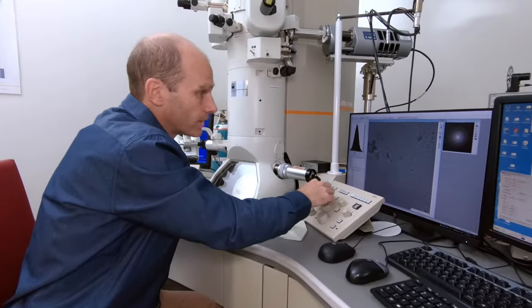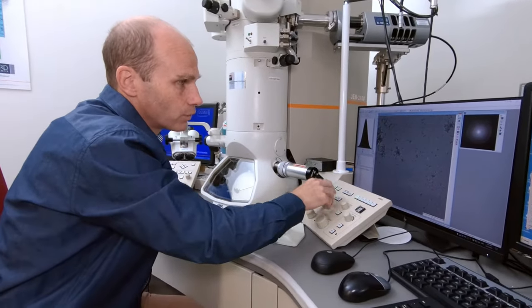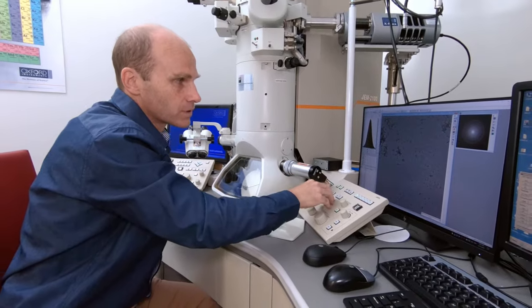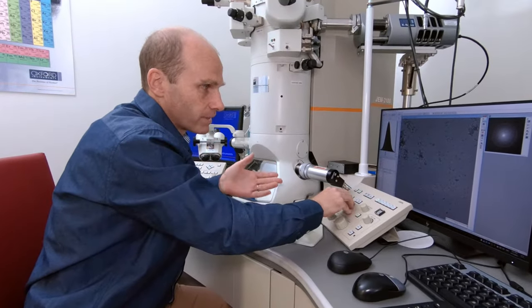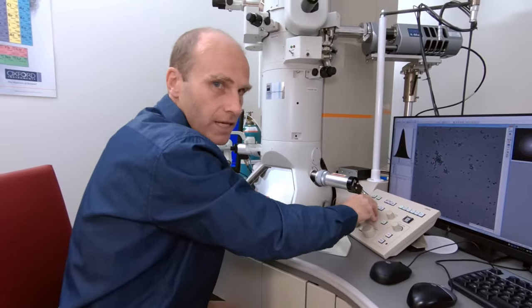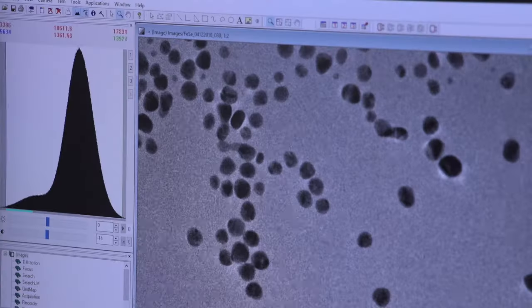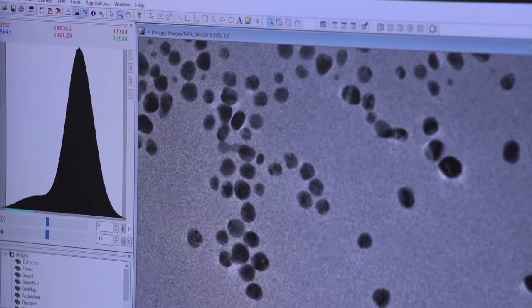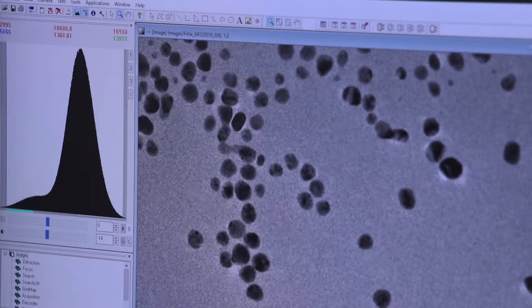We can investigate that by increasing the magnification. Because the magnetic lenses that we use can have their strength changed just by increasing the current, it makes it very easy and accessible compared to, say, a light microscope. So now you can see the size of these particles is very easy to discern.